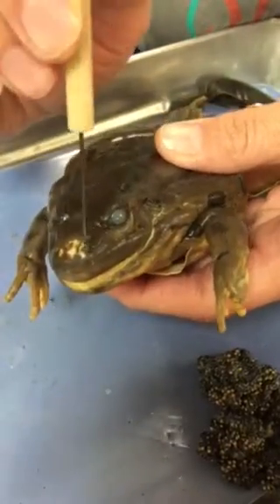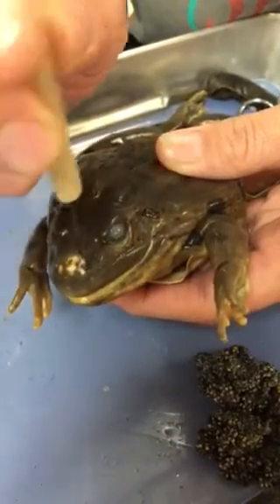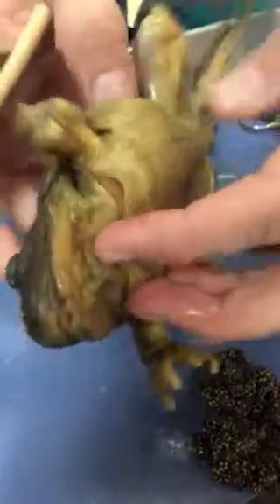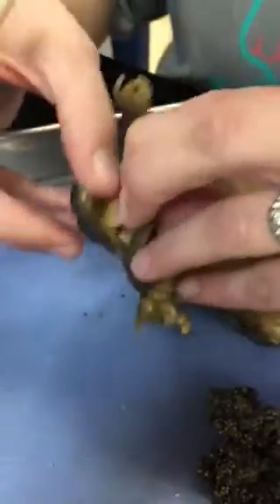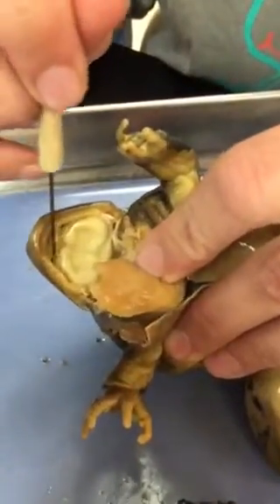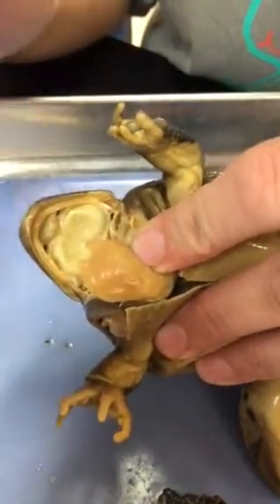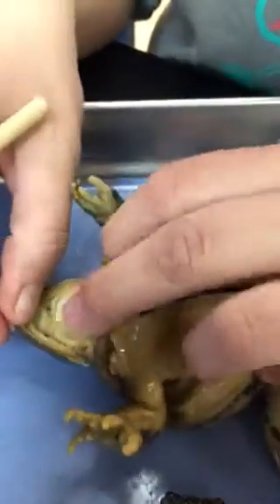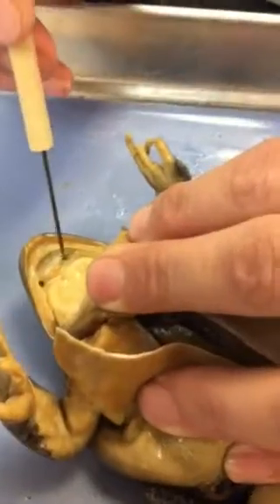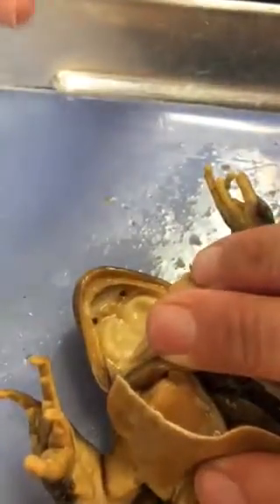Then we have here the external nares that will go through to the other side to the internal nares. So the internal nares are going to be right here. There's two of them. There's also going to be some teeth up here. And so the teeth, there's two little teeth right here. Those are the vomerine teeth. They're bony, so I really can't put a pin in them.